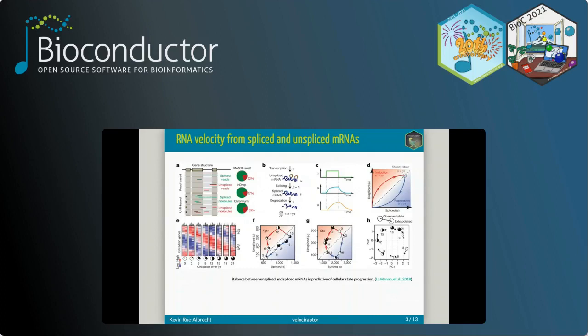This example illustrates the textbook case of circadian-associated genes, where the abundance of spliced and unspliced mRNA at various time points throughout the day increase and decrease in a way that cycles back to levels observed at the start of the day. Qualitatively, one can see in the heat map how the levels of unspliced mRNA generally precede the levels of spliced mRNA observed 3 to 6 hours later.